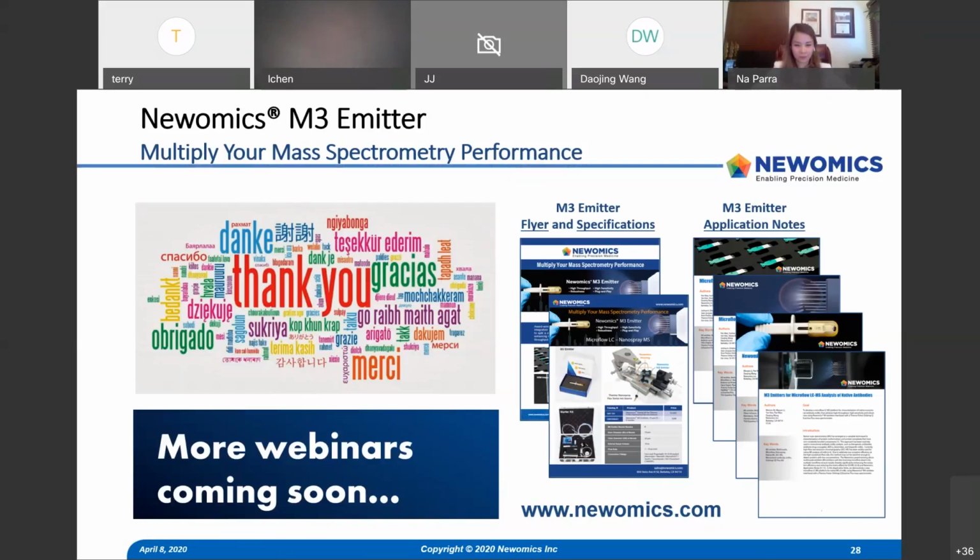One of the challenges, or one of the advantages of our emitter that turns out to be a little bit not optimal for metabolomics, is that you enhance the ionization efficiency for everything, although you do reduce the matrix effect. So in this case, for metabolomics, you are looking at the same mass window below 500 mass to charge with the solvent together.